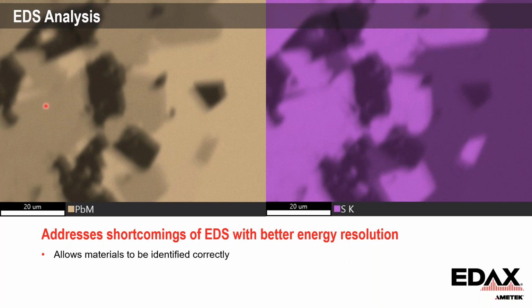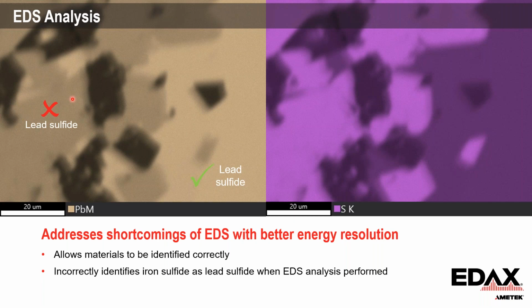Based on the EDS map, it tells you that you have lead sulfide on both sides, but this is incorrect because the lead M line is heavily overlapped with the sulfur K line. So actually this portion has a lot of contribution from the sulfur K X-rays. In this case, when we have this kind of peak overlap, EDS gives you incorrect information.